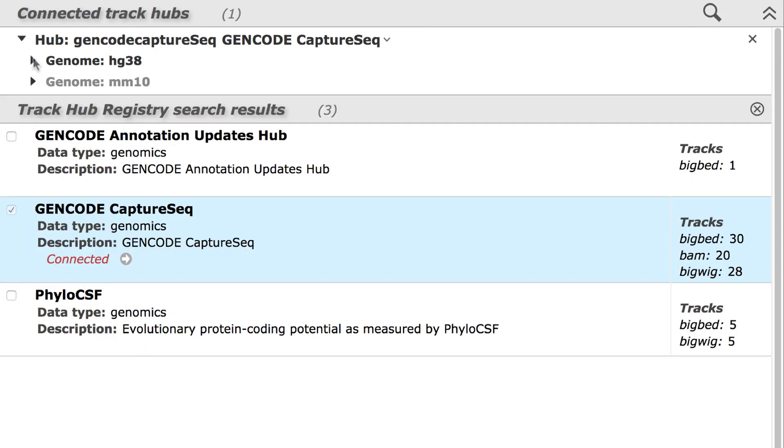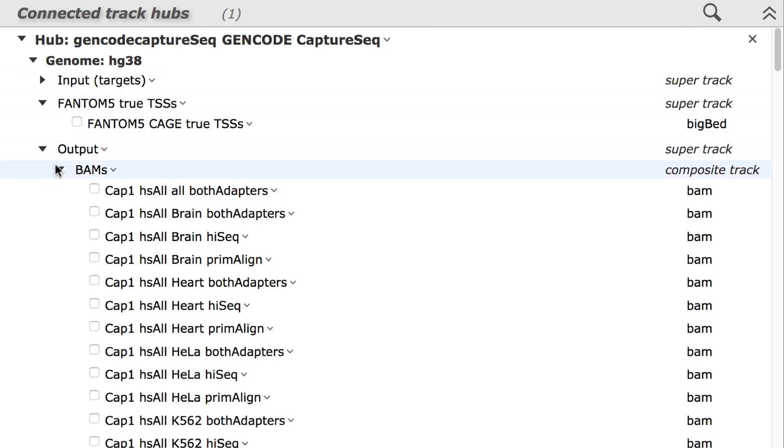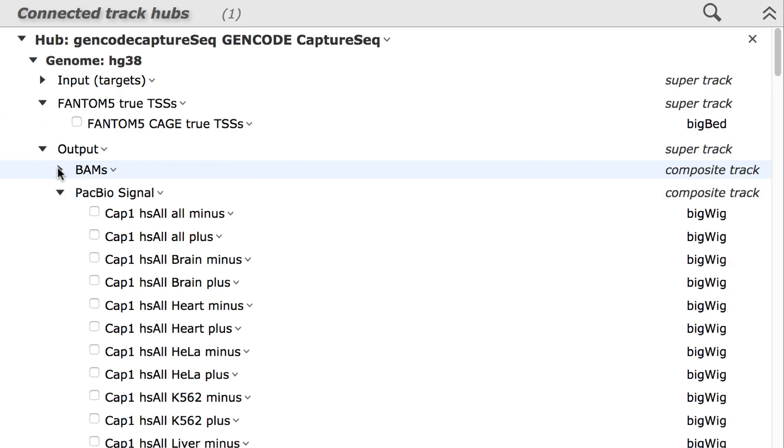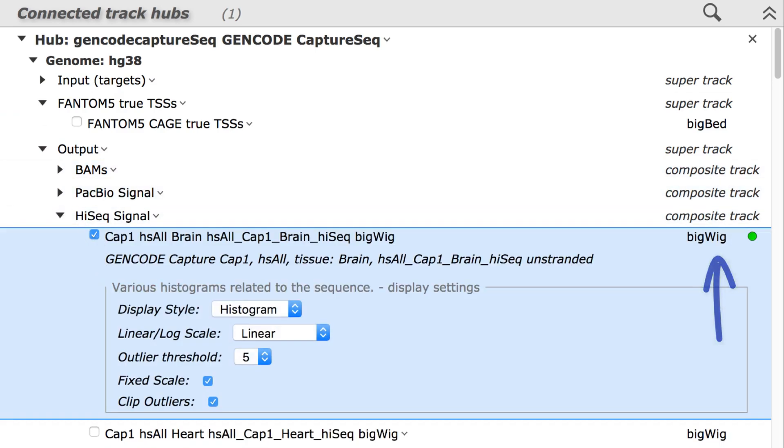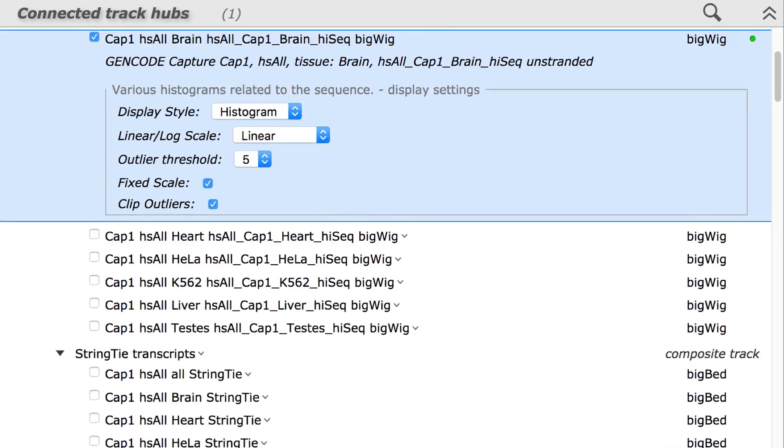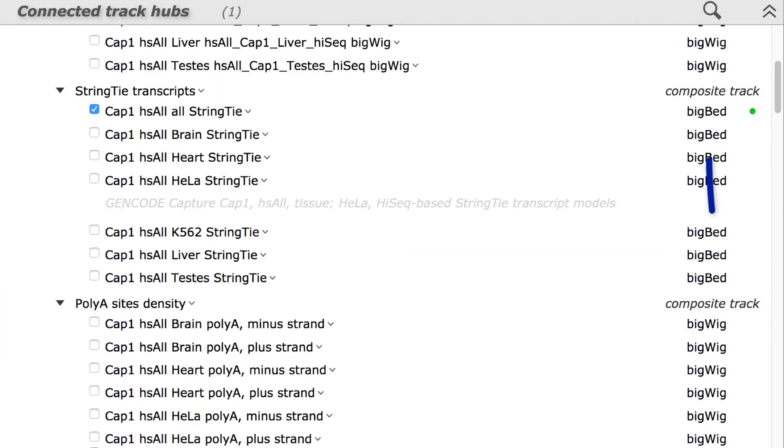Notice that this hub has data for mouse as well as human. I'll select a track representing a bigwig file and another for a bigbed file.